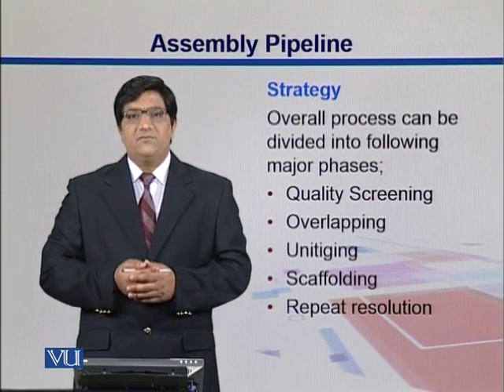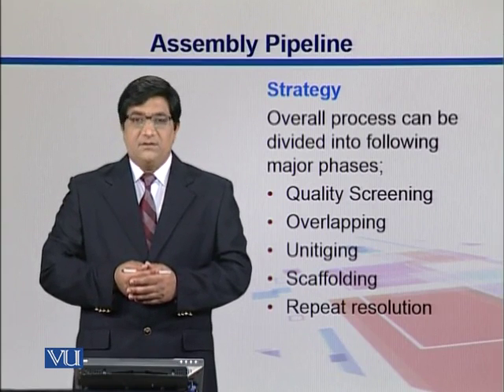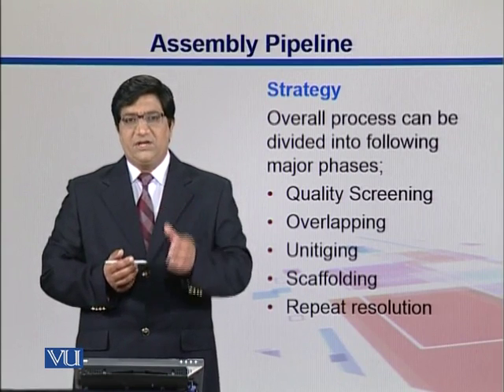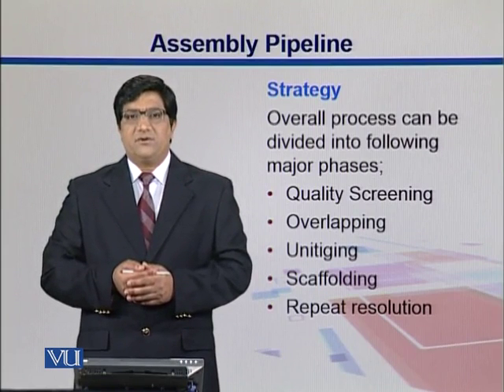What we do first is quality screening, then overlapping, unitigging, where you will have unique contigs, and then we will do scaffolding, and in the end we will resolve repeats, and our assemblies will be refined.